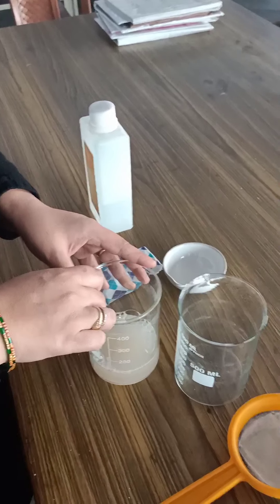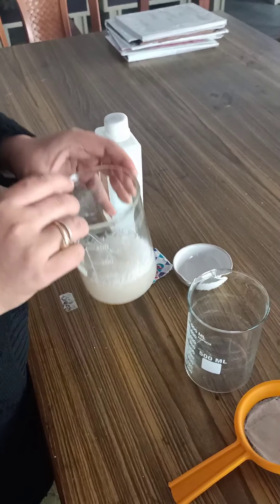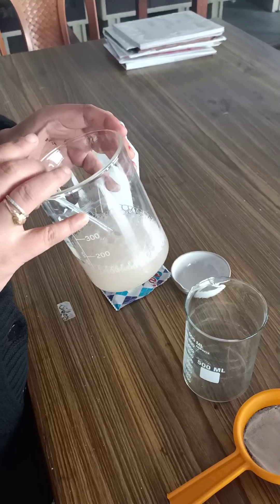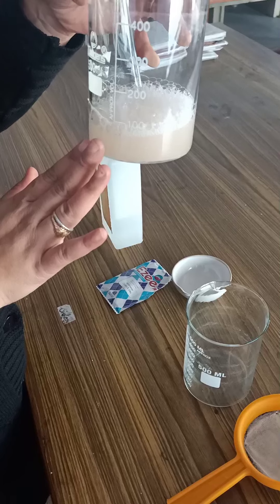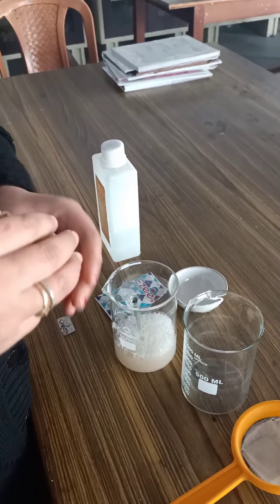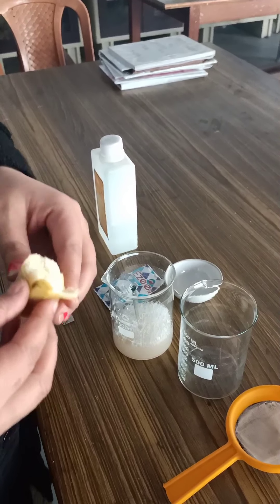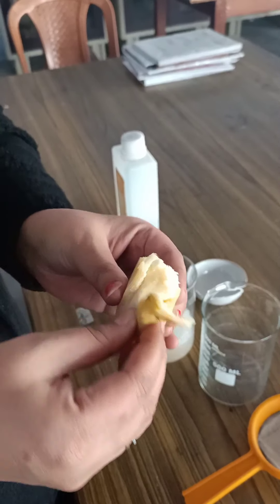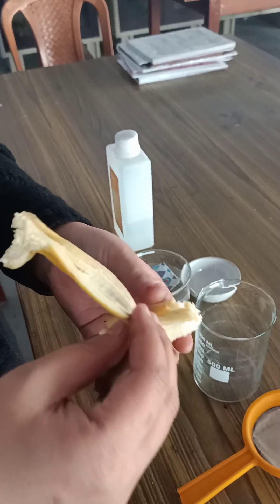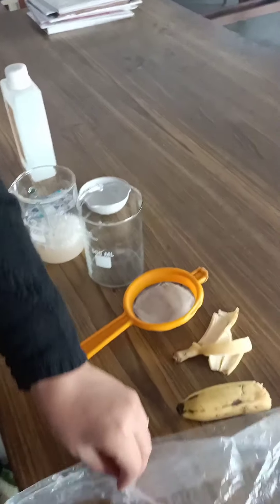First of all, we are going to take 100 ml of distilled water. In this distilled water, add around half to one teaspoon of salt. Then add liquid detergent — you can use any liquid detergent, either Easy, or a dishwasher like Vim or Spray. Add around one teaspoon of liquid detergent.